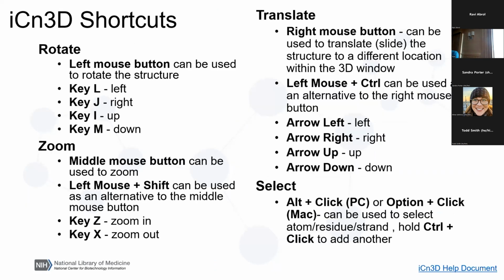So now I think it's good to just jump in and get started with iCn3D. This is going to be more of a hands-on activity. I know that there are people who are sitting in a room and working on this, and it might be hard for you to ask questions. So if at any point you're confused or you need things to slow down, please let someone, maybe Ravi and Tom, know, and we can try to address that.